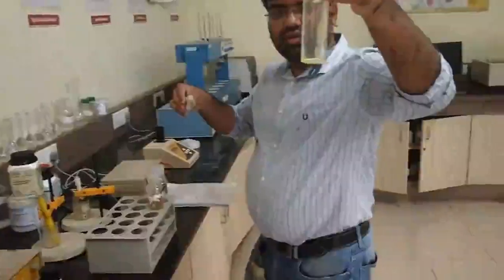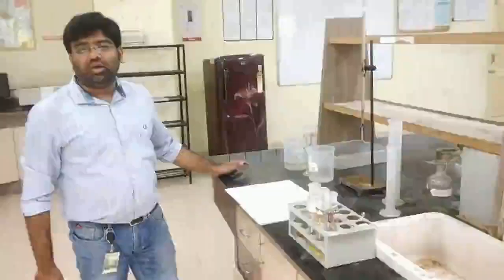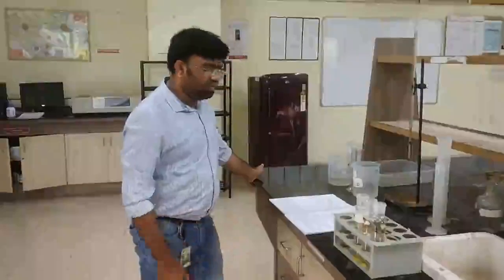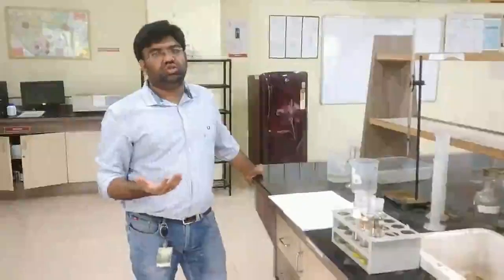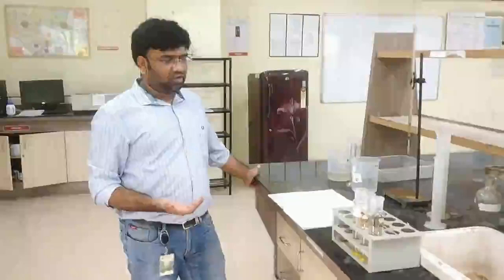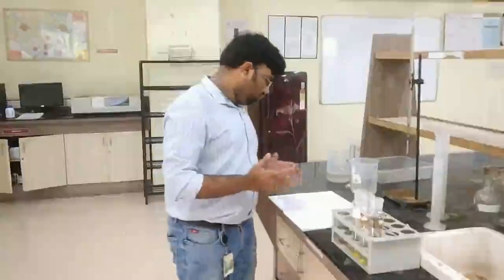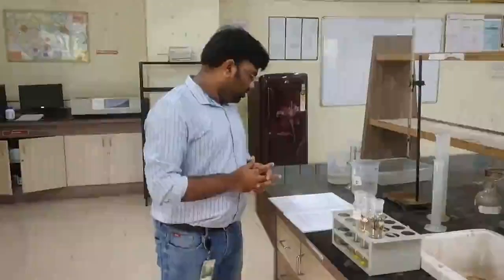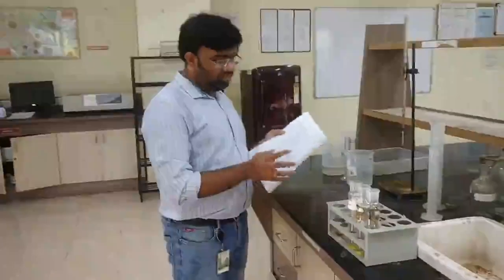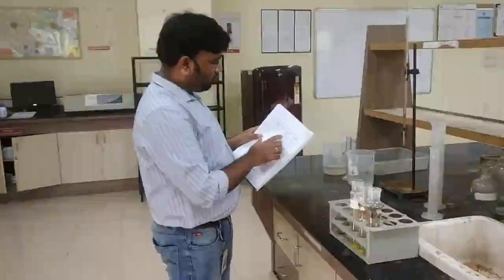you can see the yellowish color that you have got, right? Okay, so we are expecting the COD value for this sample to range in like 400 to 500. So we don't know exact value, but it may differ in the range of like 300 to 500. So correspondingly, the dilution factor according to the dilution chart is 1. So here we are going to directly take 20 as a sample.